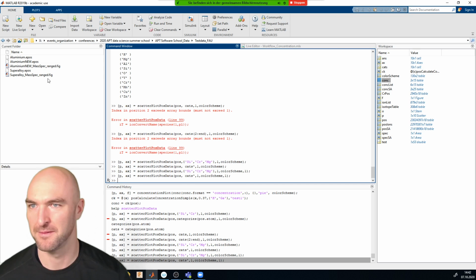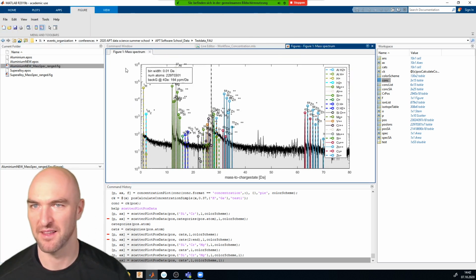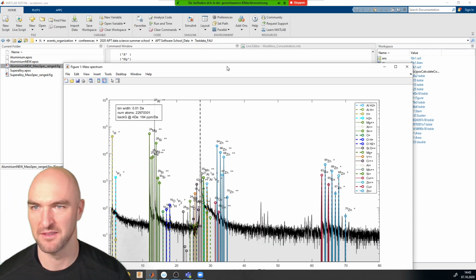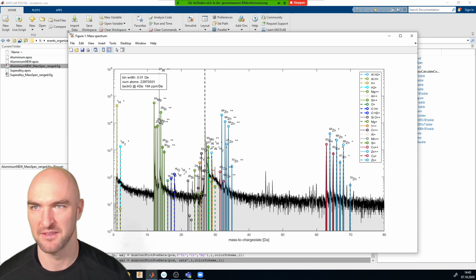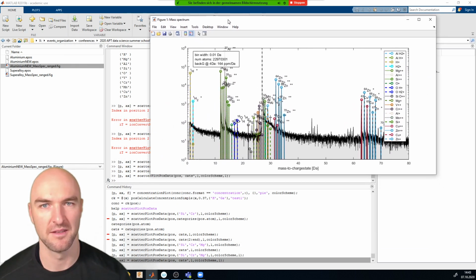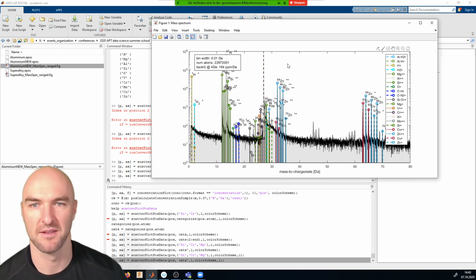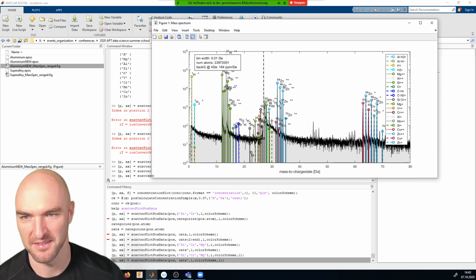In particular, in the beginning, when you need to click somewhere, it goes much slower because it's not really clear. Now it's much better and clearer, but I really got lost already there.